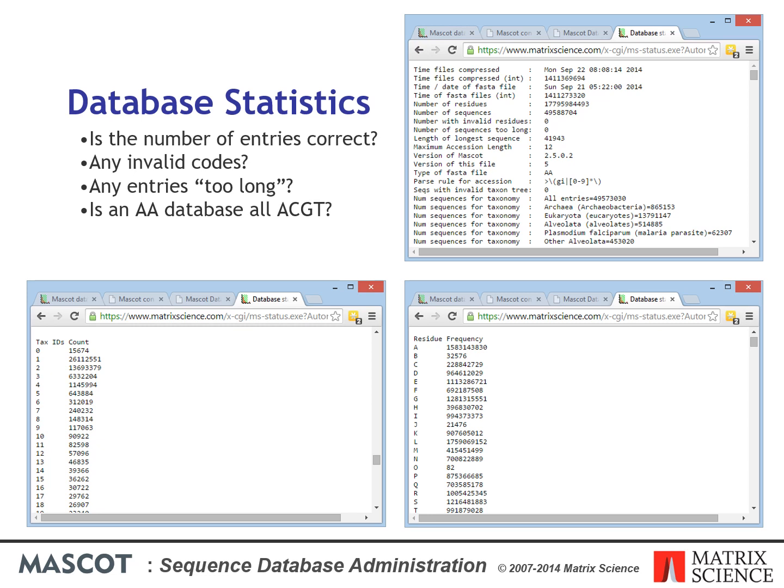And although it is rarely possible to achieve 100% accuracy for taxonomy, you certainly want the accuracy to be better than 99%. Otherwise the results could be misleading. Near the bottom of the stats file is a list of the number of entries with 0, 1, 2, etc. taxonomy identifiers. From time to time, check that the number of entries with no taxonomy identifiers is well below 1% of the database. Here it is a very healthy 0.03%.